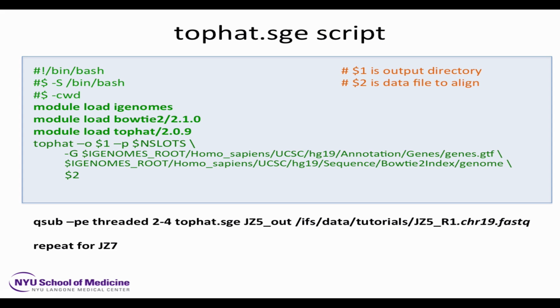So if you write this, qsub it, hit qstat, and it runs. In other words, you get a qstat R, and you qstat again 30 seconds later, and it's still R. You're very successful. Mostly when I do this, that never happens.